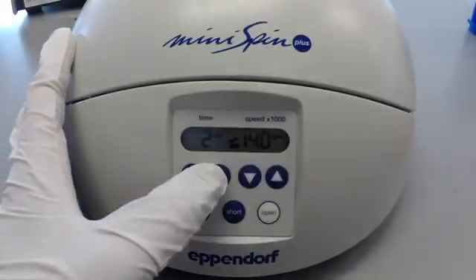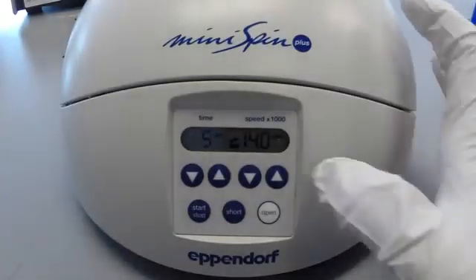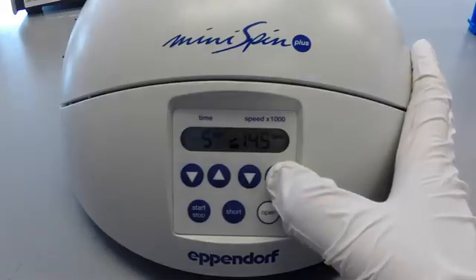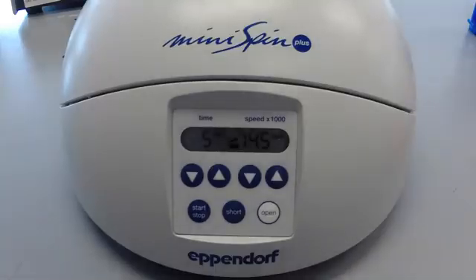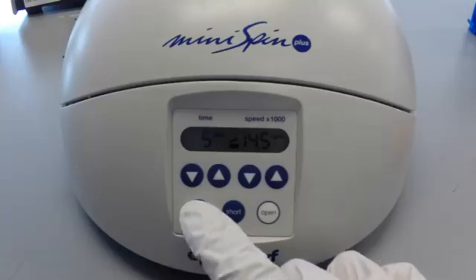Change the centrifugation time by pressing the arrows to the desired time, in this case 5 minutes. Press the arrows by the speed to navigate to the proper RPM. In this case, 14.5 thousand RPM is the max this centrifuge can perform and is close enough to our desired speed. Press the start button. The centrifuge will begin to spin.